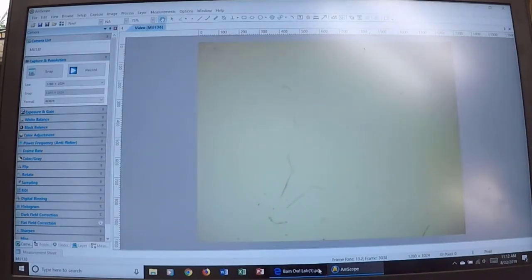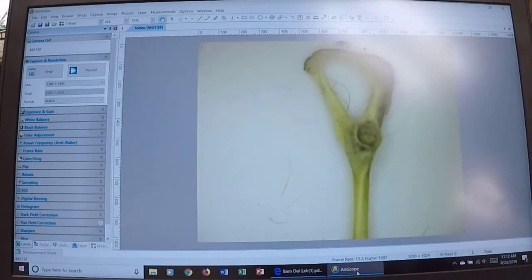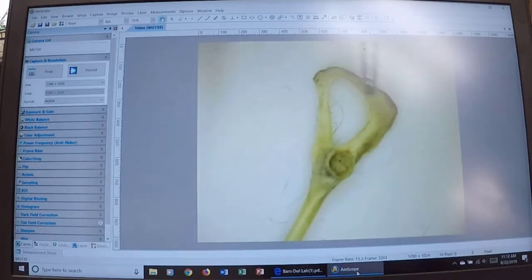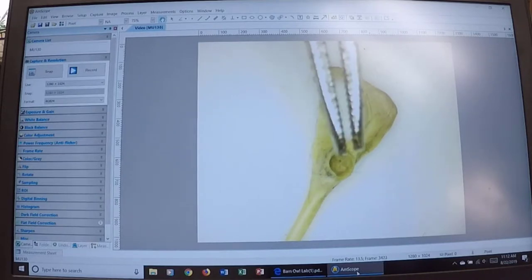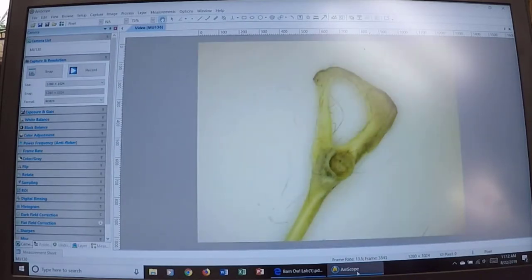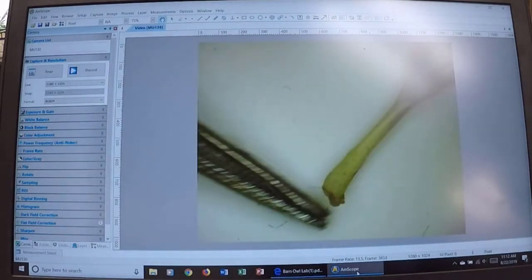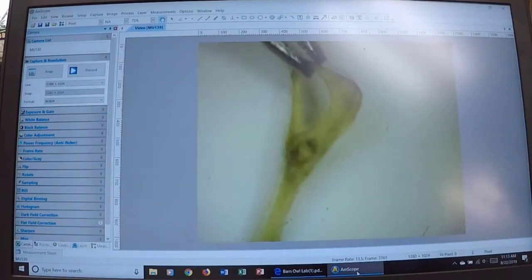The second bone is a hip bone. One great, easy-to-identify feature of a hip bone is that it's a closed circle, especially in rodents. There's an indentation which is one part of a socket. The upper leg bone fits right into this socket and allows for rotation of the leg. You can see the other end of this bone — it's fairly easy to tell no matter the size.